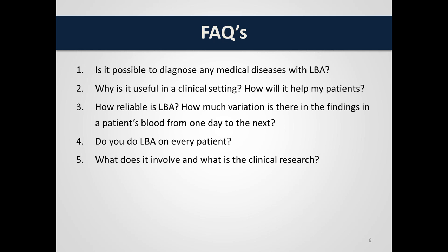There is, of course, a large part of live blood analysis that is purely based on normal standard hematology. So as you know, that information has been researched many years ago, and there really is no need to subject that information to any further research. However, because of the differences between live and stained samples, there are many other signs and indicators that don't form part of hematology, and there have been some small-scale studies that were done, and we can definitely go through those in more detail, perhaps in another webinar.